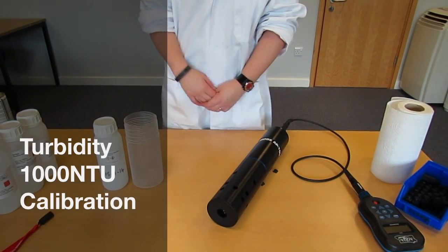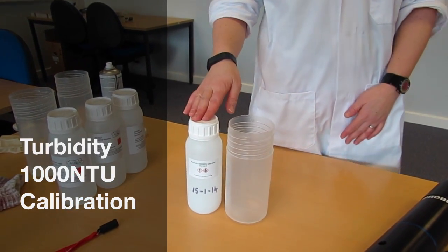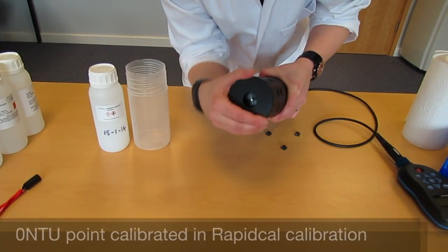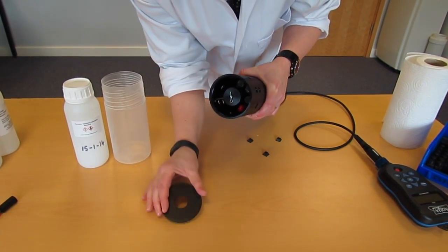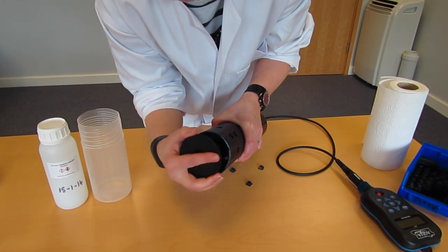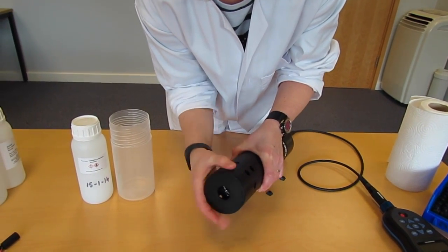Next I'm going to calibrate the 1000.2 of the TURB electrode, the 1000 NTU point. First of all we need to remove the red cap that is on the ISE electrode. This allows us to use the wiper arm during calibration to dislodge any air bubbles that may have formed on the TURB electrode.